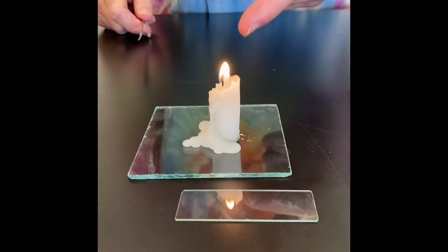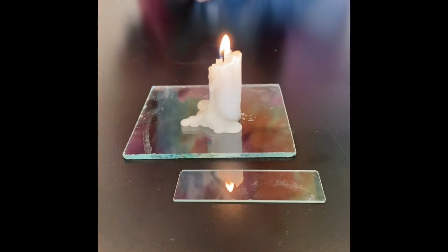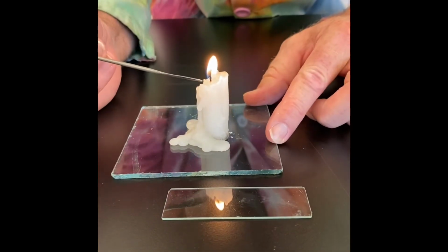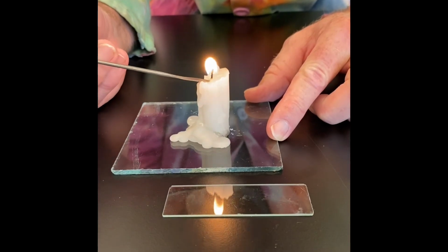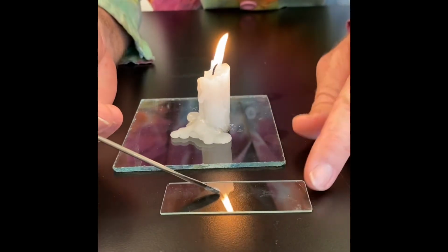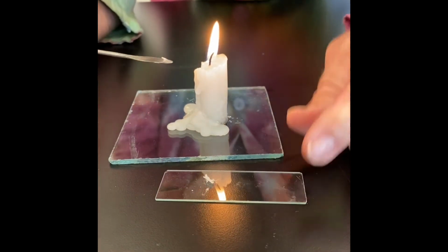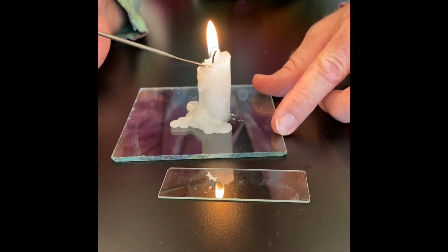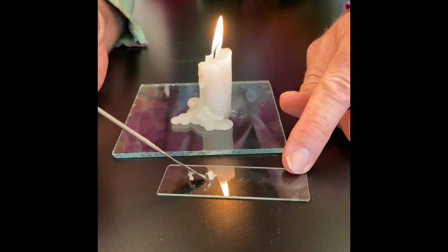I now have a micro slide and a micro spatula. And what I'm going to do is transfer some wax from the bowl of the lit candle onto the micro slide. Like that.